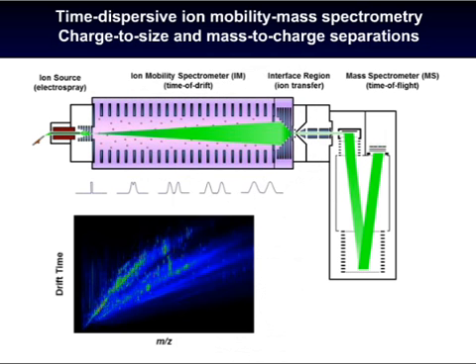So now this slide shows sort of a generic arrangement of an ion mobility mass spectrometer. A lot of these experiments have been facilitated by the advances at PNNL and the development of ion funnels. So what we have is the drift tube, which is shown in purple, where you inject ions into this gas-filled chamber, and the separation selectivity is based on the number of collisions with a background gas, which is shown by the little pink dots.